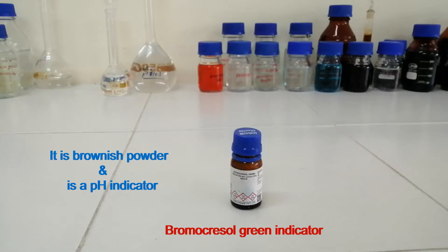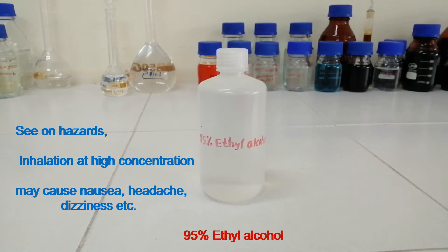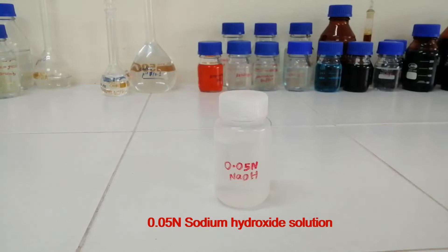This is Bromocrysol Green Indicator. It is a brownish powder and is a pH indicator. This is 95% Ethyl Alcohol. Inhalation at high concentration may cause nausea, headache, dizziness, etc. This is 0.05 N sodium hydroxide solution.